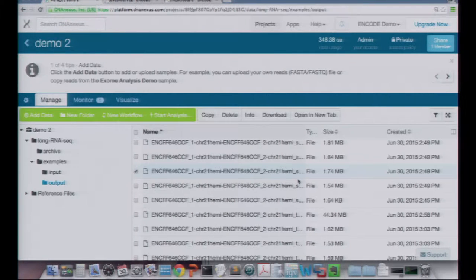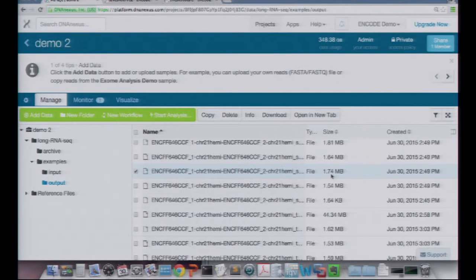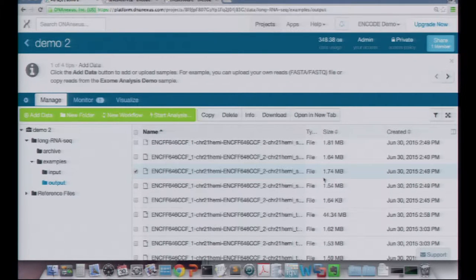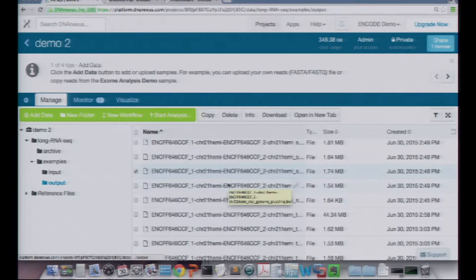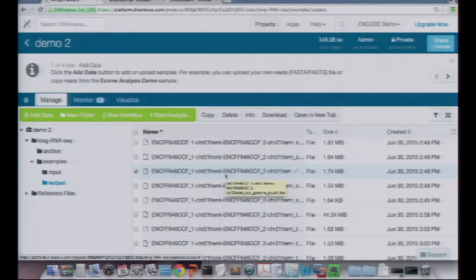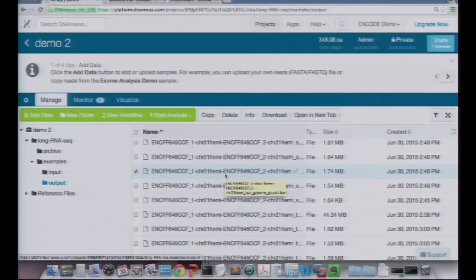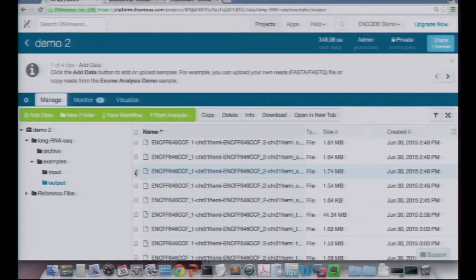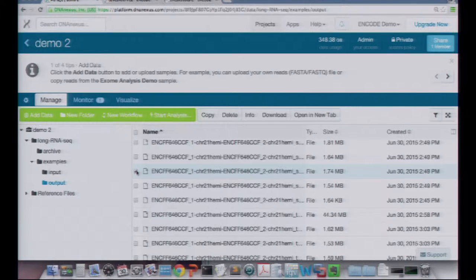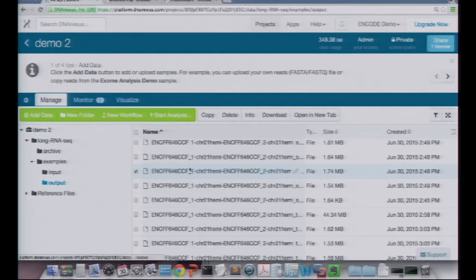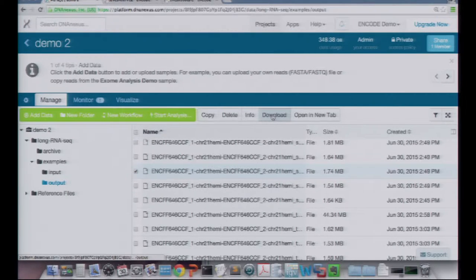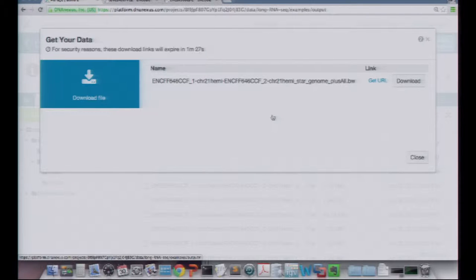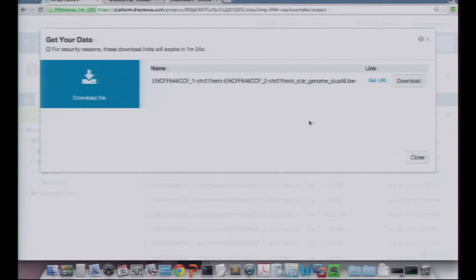But we're going to just cut and paste that URL into the Santa Cruz genome browser, just as Pauline sort of showed as an example yesterday. And it should be only a few steps. So you can see as the file is, I mean, this is a very small bigwig file. It's only a small chunk of the genome. But it's still a megabyte and there's 300 of you, so it's not going to work. So this file is selected. You can tell because it's blue and it's got a check mark, right? Everyone with me so far on this part? Or if you don't have a file, then you can follow along later. We're going to click download, which doesn't download the file. It gives you an option to download the file later.